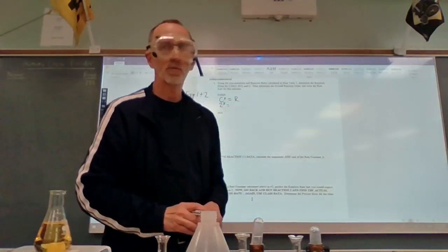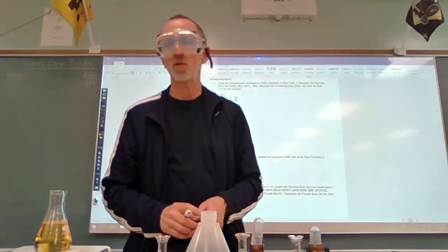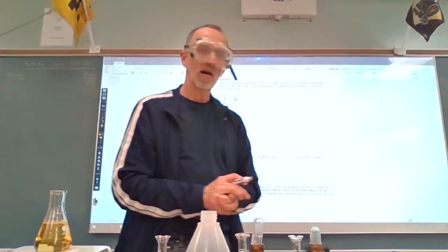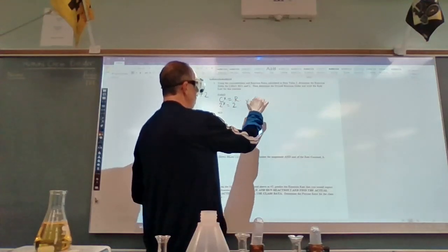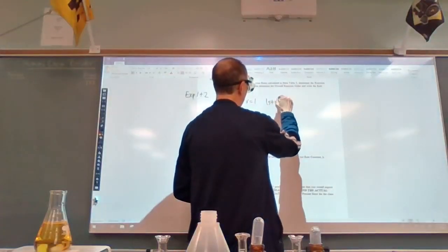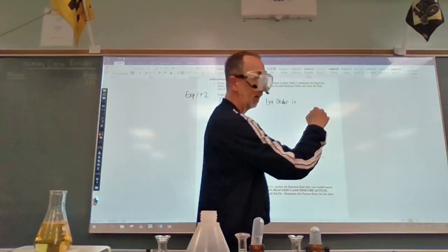And if you look at the rate column down in the lower data table between reactions 1 and 2, we just did that. Reaction 2 was 4.0 times 10 to the minus 5. Reaction 1 was 2.0 times 10 to the minus 5. The factor by which that is changed is also 2. So R is 2, X equals 1. So this is first order in acetone. Okay.